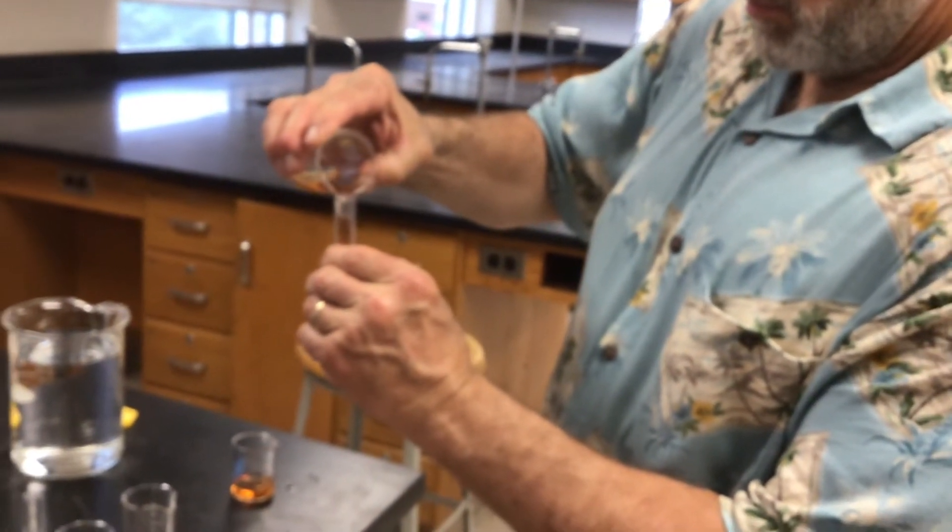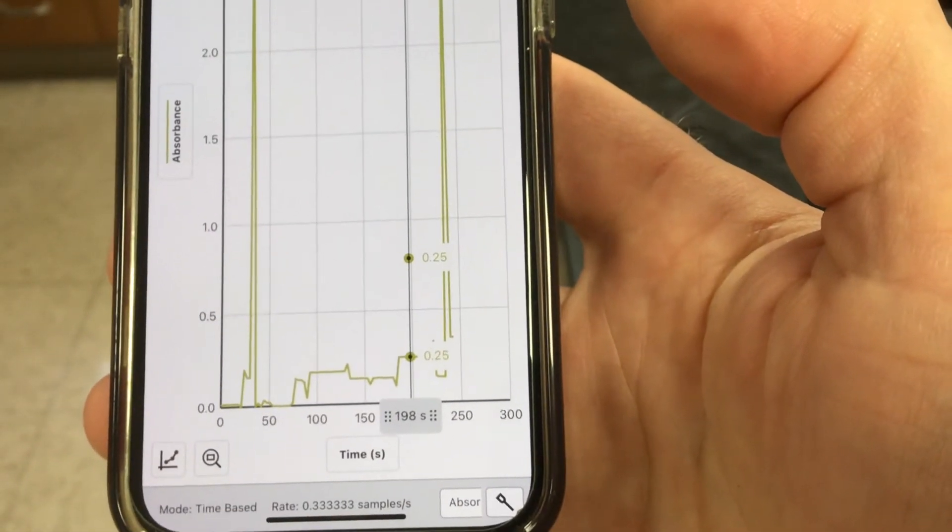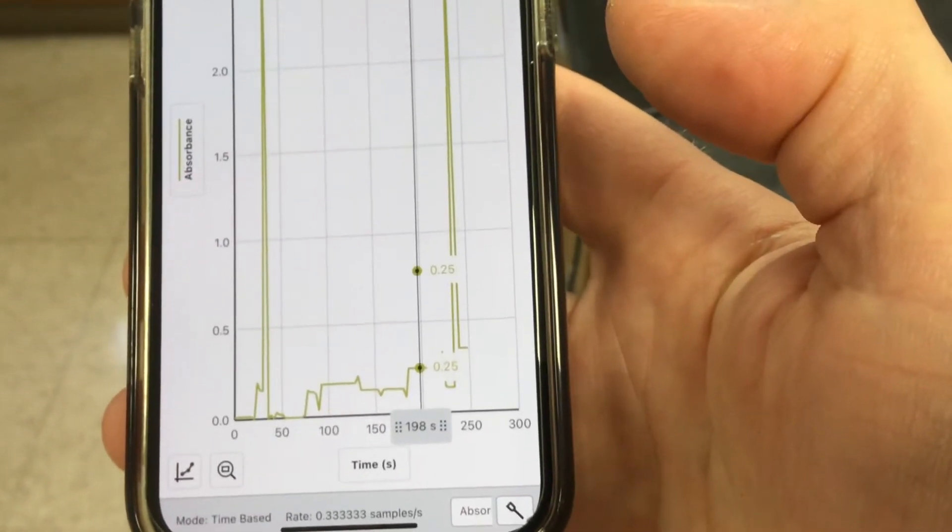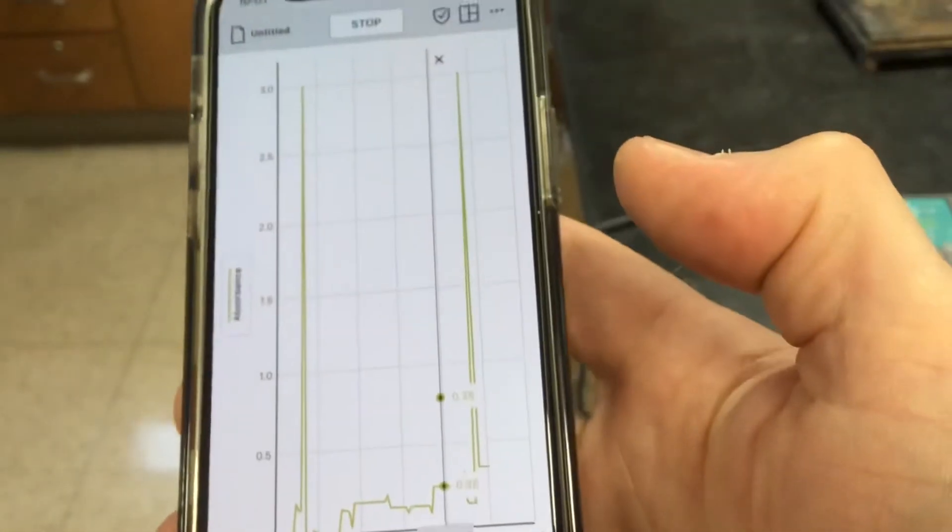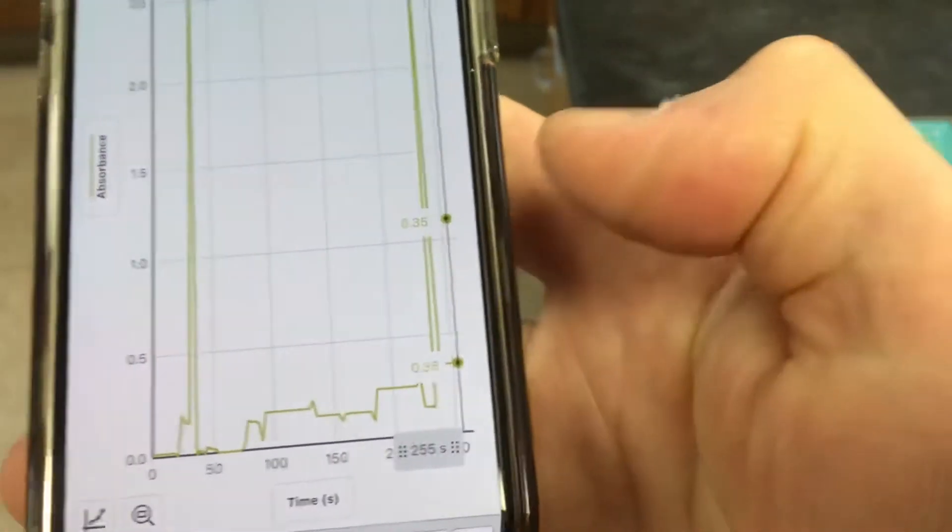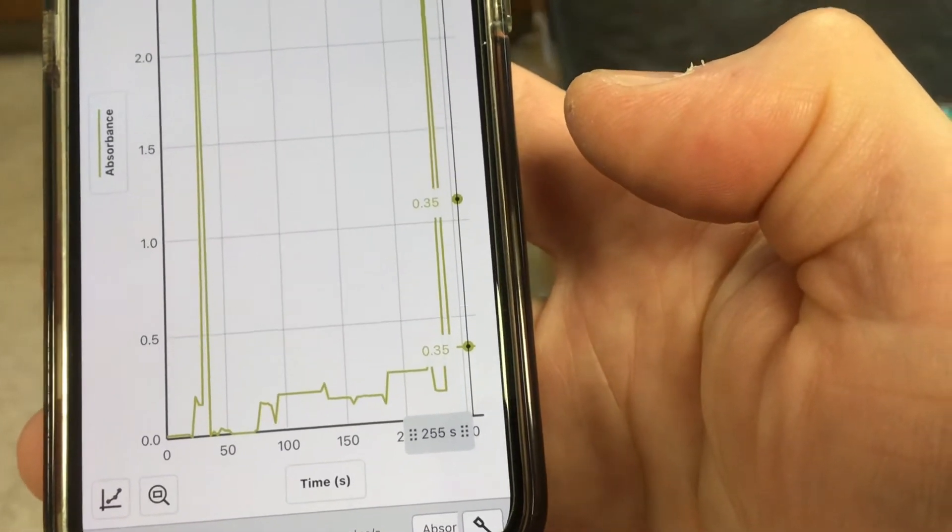Okay. Here comes number three. The cuvettes going in and out of the spectrometer will cause that jump there, but then we just wait for it to go stable. Our new absorbance there for trial three, 0.35.